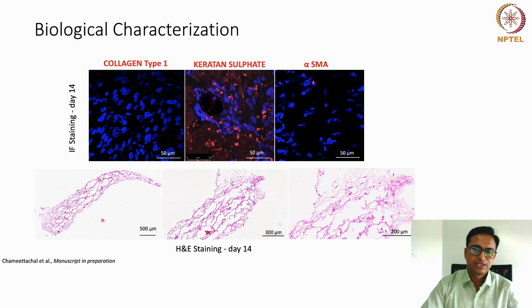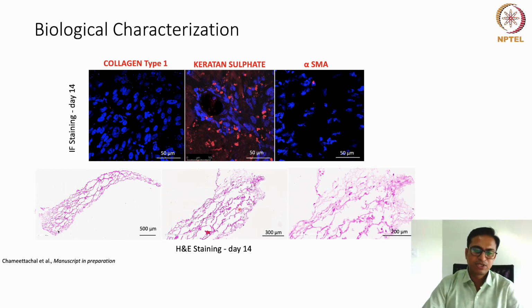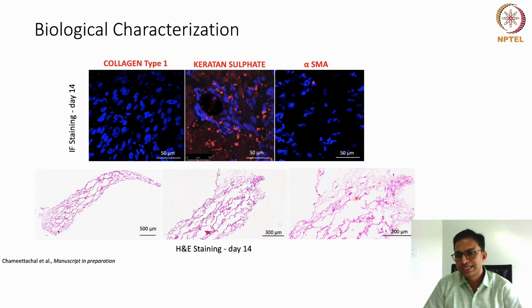That is very important. And this is the histological analysis of the corneal tissue. Here you see the collagen fibril arrangement is not up to how it is present in the native tissue, but anyway they are maintaining a particular order, and probably with time this can be further remodeled. So this is an important finding from this study, that the cells are viable, the cells are functional, and they can maintain their keratocyte-specific functions.